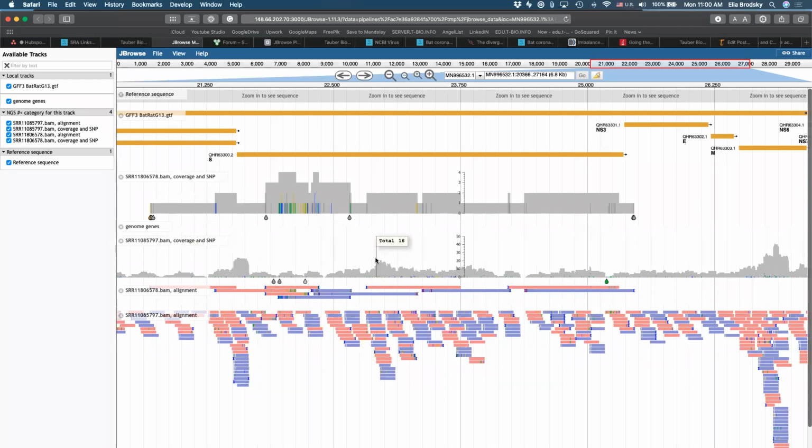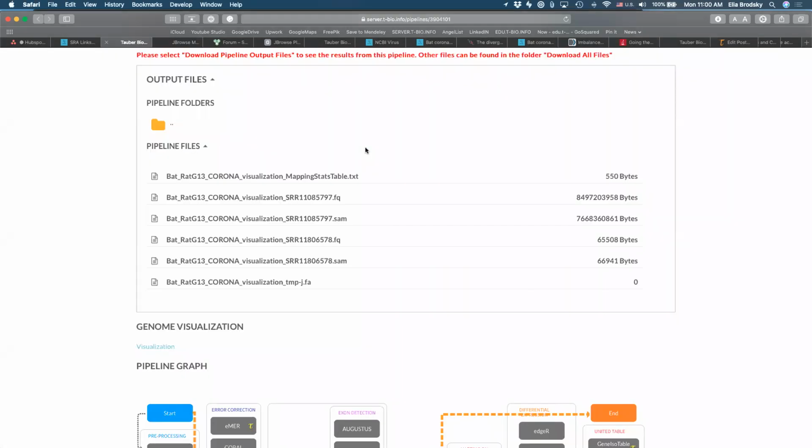So RNA-seq is expected to generate a lot more data, right? A lot more reads, but a lot of those should fall onto the reference genome from the human. Let's take a look at what other outputs we have to help us understand the overall number of reads mapped onto the reference genome. To do that, we can download this file right here, mapping stats table.